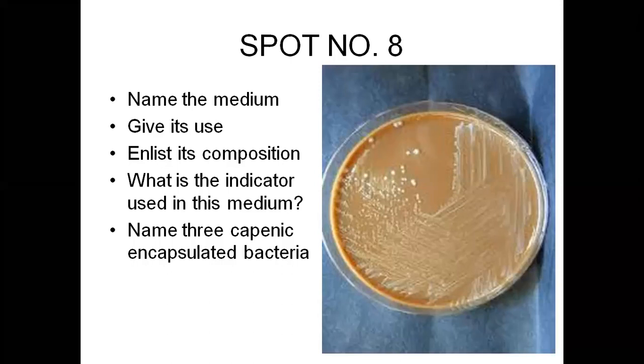So the samples coming from these areas are cultured on this chocolate agar along with blood and MacConkey also. So CSF, swabs from nose, throat, ear, and swabs from vagina and cervix in cases of Neisseria can be cultured on the agar.